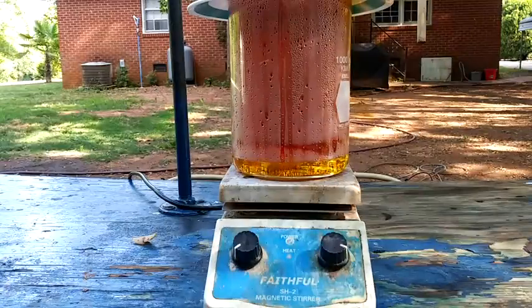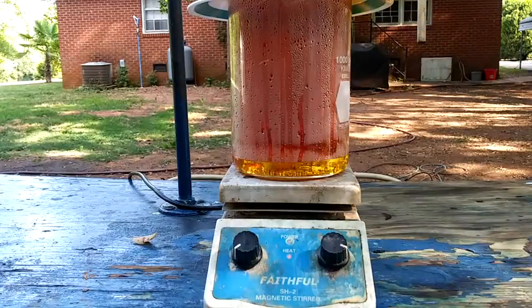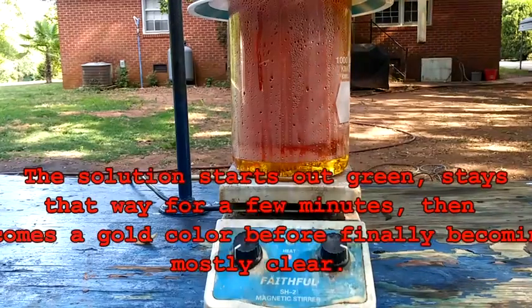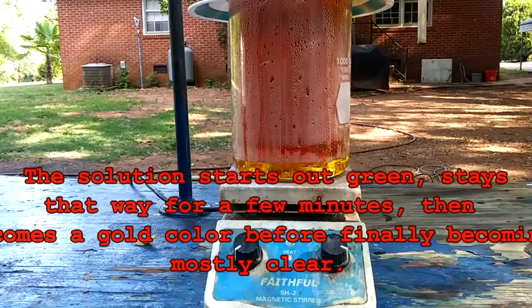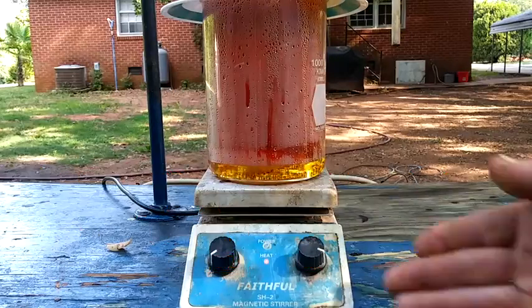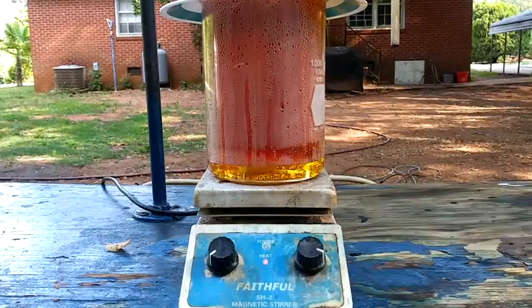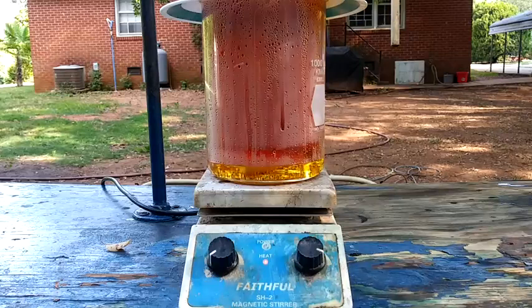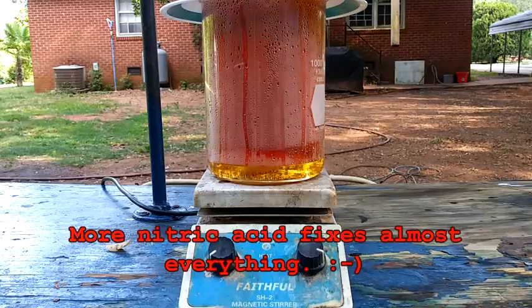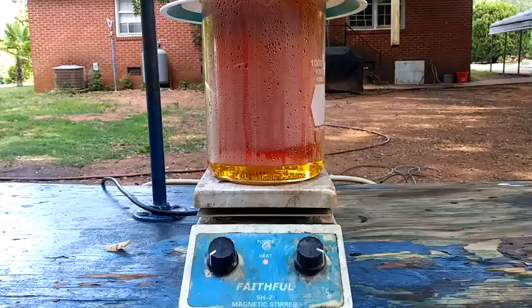Alright, so we are about 5 minutes into this, approximately. And you can see we're starting to get some condensation come back down. So that's a good thing. It's got this nice golden yellow color now. It's persisting. And the gas production has died down a little bit now. So again, that's why I've got the heat cranked all the way up to max at this point. And we will just let it keep going. Whenever the reaction seems to really slow down or come to a halt, you just add a little bit more nitric acid and let it keep going until it's all completely dissolved.